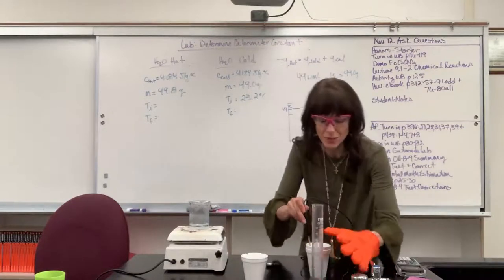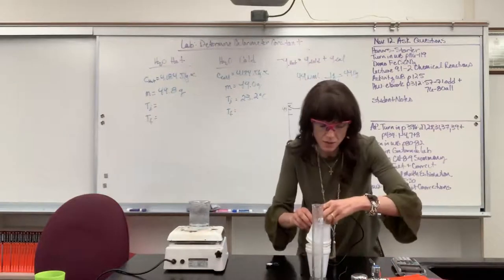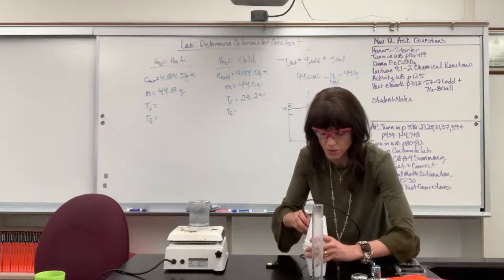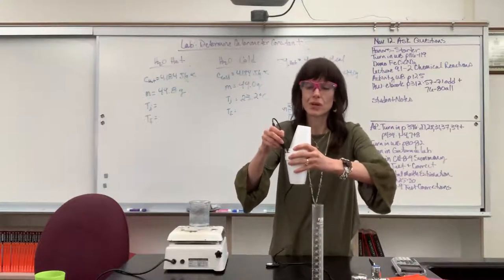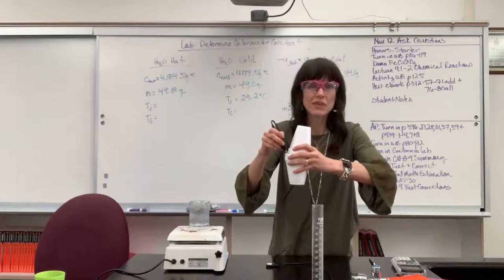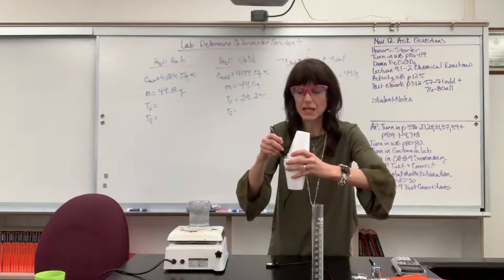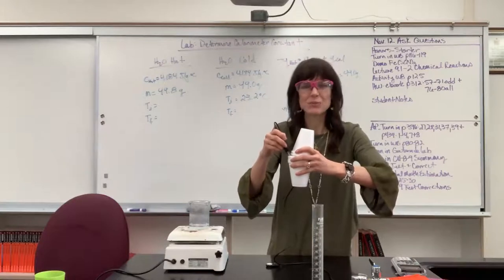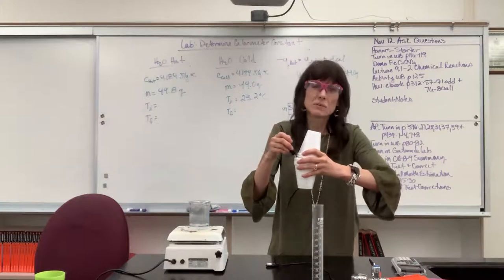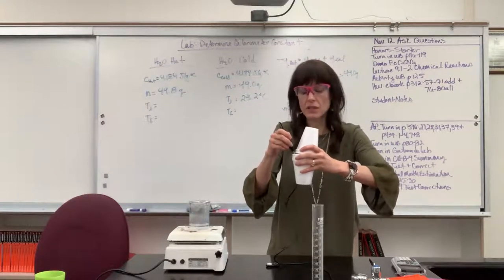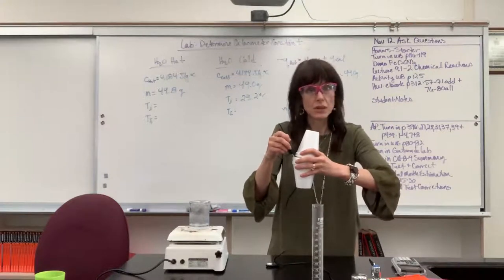Oh, and you can see a little bit of steam go out. I begin stirring, and I want to cover this. Okay, welcome to high school chemistry. Okay, another honest truth. Some of that heat escaped into the air, and I'm trying to trap as much as I can. And even when I poured it in, you can see a little bit of evaporation. It's okay, you can talk about it in your evaluation. What are limitations of the lab? What are errors of the lab? What would you do to get better, stronger data?